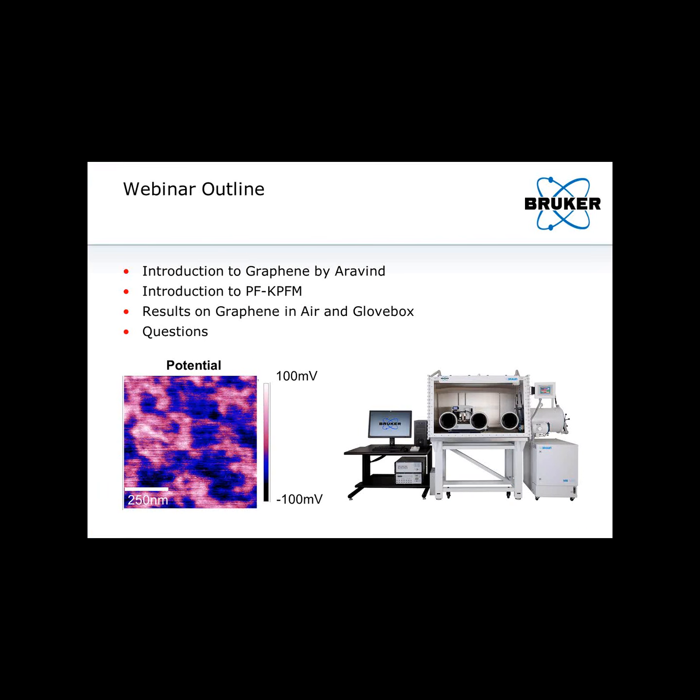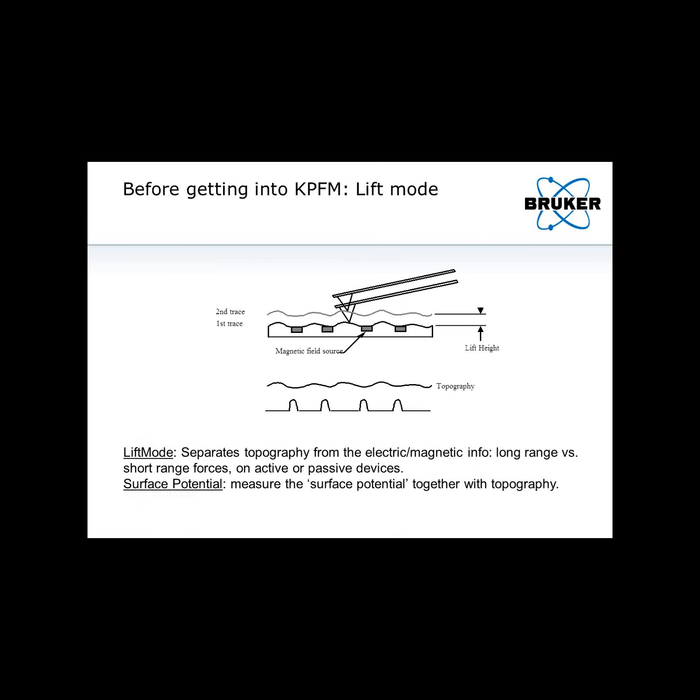So yeah, thank you, Aravind, for that introduction. And now I will introduce KPFM. But before getting into that, let me just briefly mention the importance of lift mode. That is an essential part of KPFM. And what lift mode is basically a way to retrace the surface without actually being in contact with it.